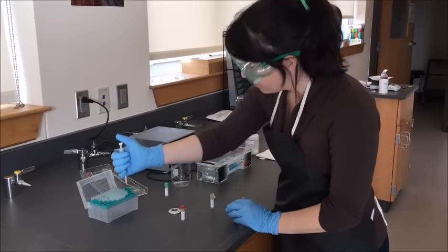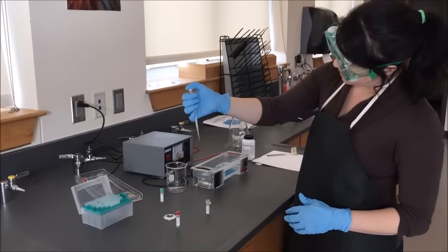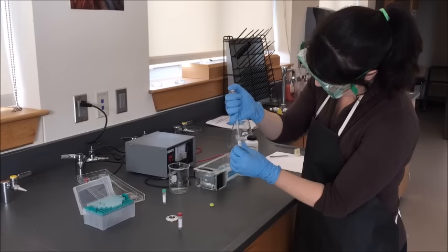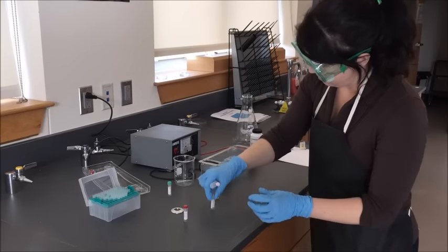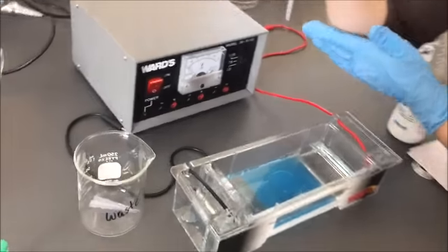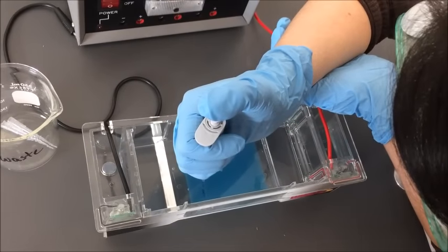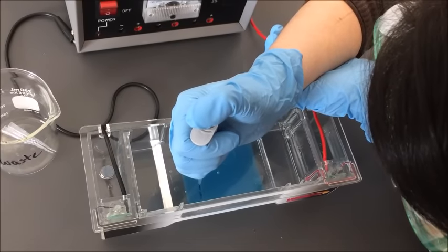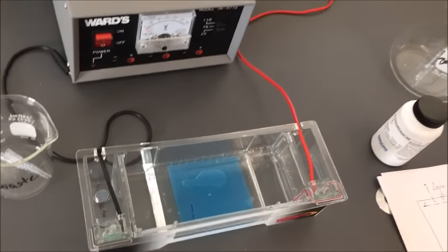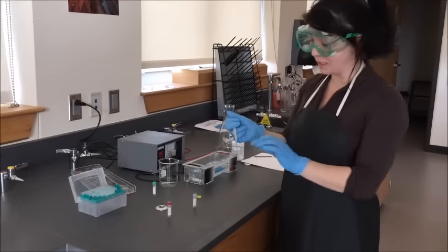I remove the cap, then come over and push down firmly to make sure I have a new clean tip on. I push down to my first soft stop, insert it into my sample, keeping my eyes on it to make sure I've got what I need, then pull the sample up into my tip. I come back over to my gel, support my dominant hand with my non-dominant, making sure I'm using the correct lane. I go down directly into the chamber, push to my first stop, then down to my second stop, and pull directly out straight.